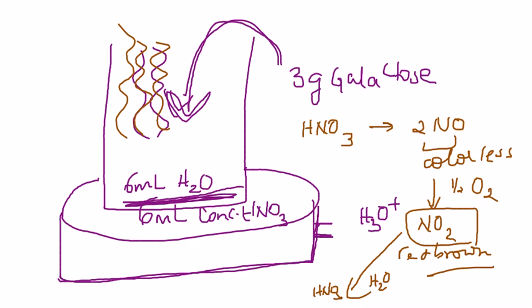You will continue to keep warming the mixture as that exothermic reaction, that red-brown evolution of fumes, keeps on going until no more fumes are being formed. And at this point of time, your slurry is going to start generating a white solid along the sides. For some people, it's so dramatic that all of a sudden they have nothing, and then the next moment the product just crashes out. For some people, it's a little bit slower, and they would see solid appear on the sides. But all in all, the solid is going to take over the beaker, and it's a pretty dense white precipitate. It's kind of difficult to miss it.